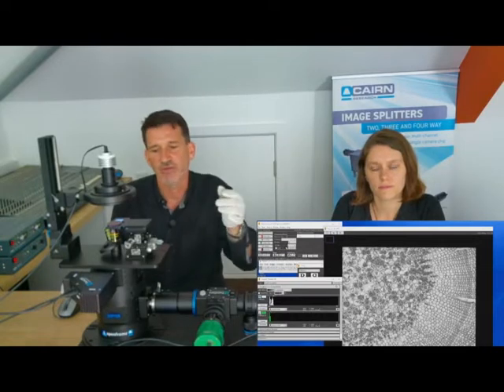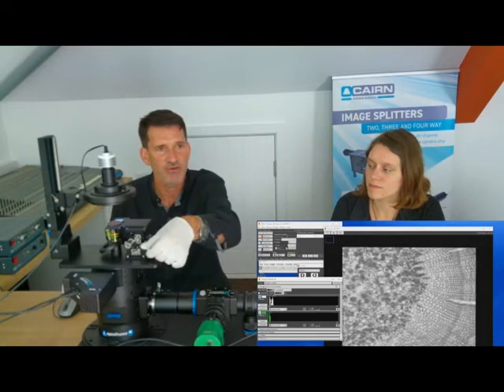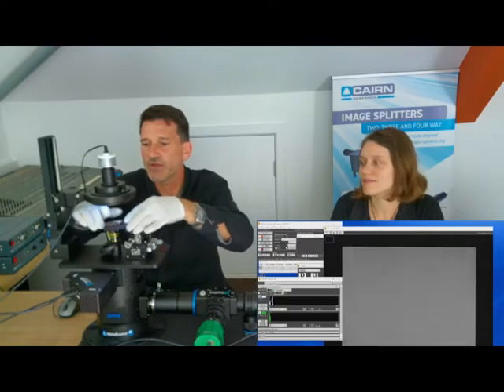We're very pleased with this simple microscope. Basically everything's adjusted with micrometers. We've got the magnetic slider for doing coarse macro adjustments to get the thing vaguely in the right place. I've lost it there. And then once we find it... Tell you what, it's not moving. Just one second.